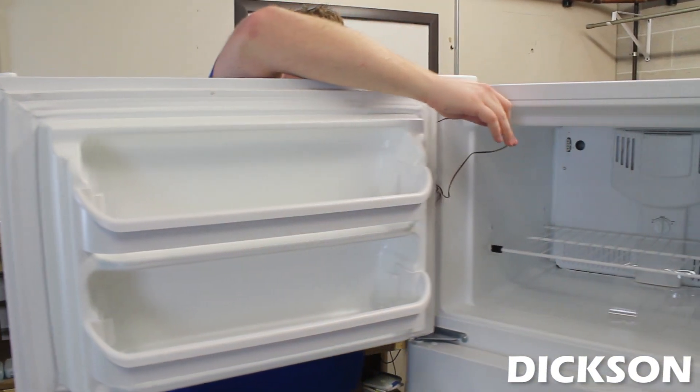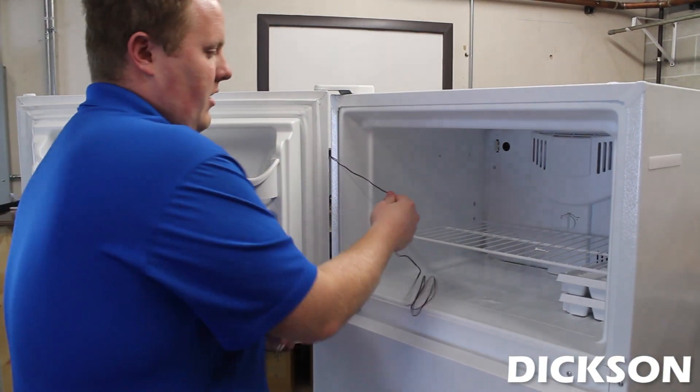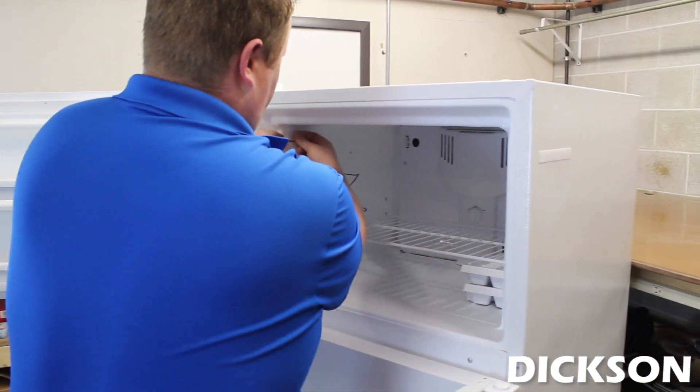You just pull the wire through like this, then come around here and run the unit right along the side. A little piece of packaging tape will hold that unit and this wire, and make sure that it doesn't affect any of your readings.